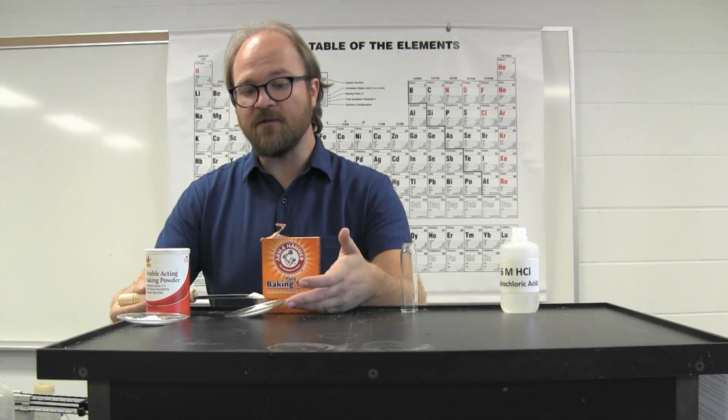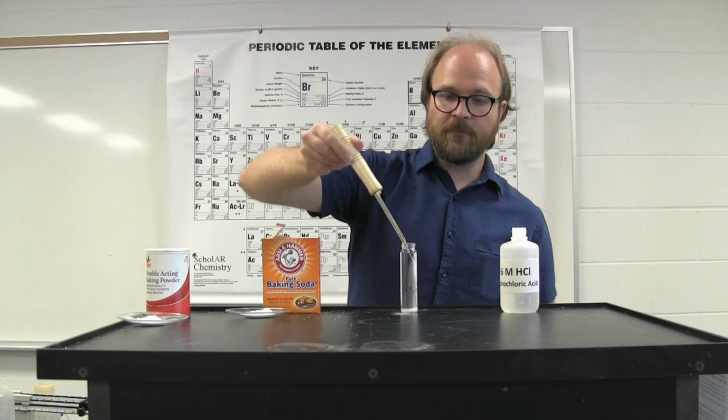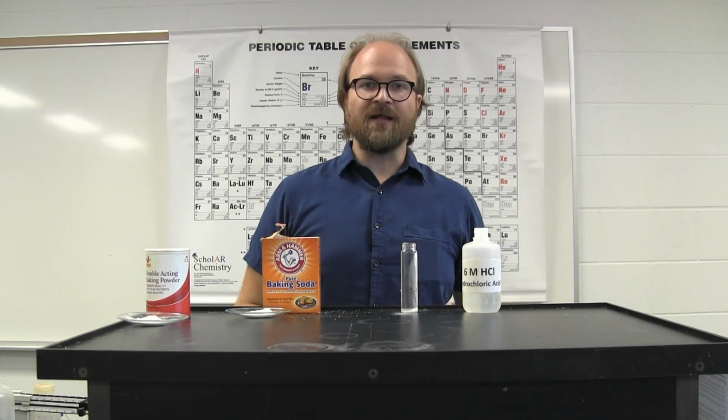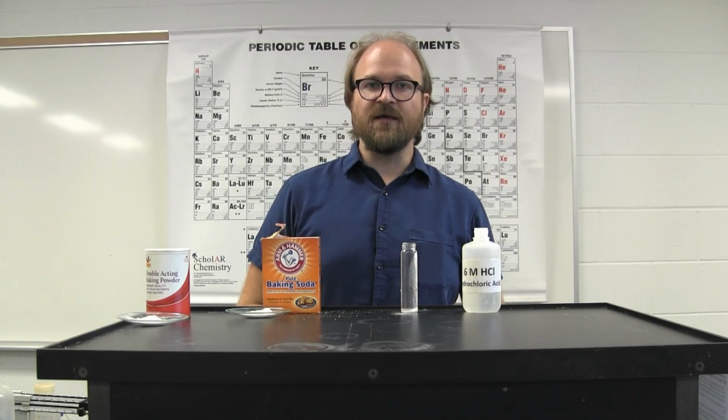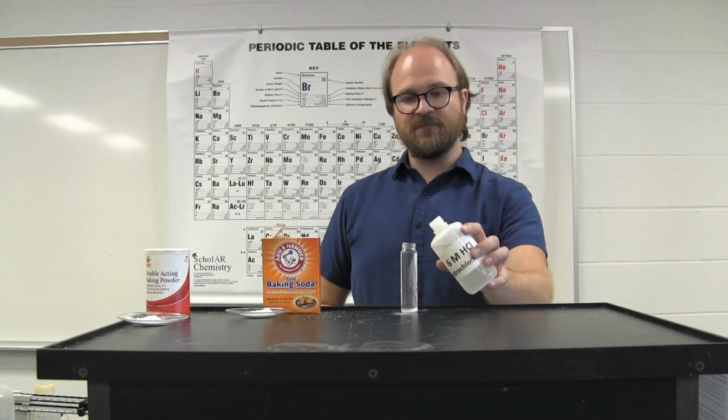In this experiment, we're reacting carbonate with hydrochloric acid. When a carbonate reacts with hydrochloric acid, it generates water and carbon dioxide gas.